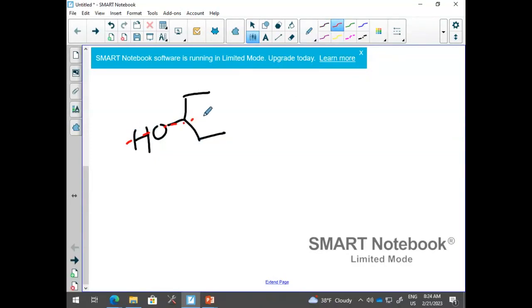So you can draw a line, separating the molecule into two symmetry-related parts. The top and the bottom parts are symmetrically related. So that leaves this molecule with only 1 carbon, 2 carbon, totally 3 carbons. And for those 3 carbons, if you look at the chemical shift value, this carbon should have the highest chemical shift value.